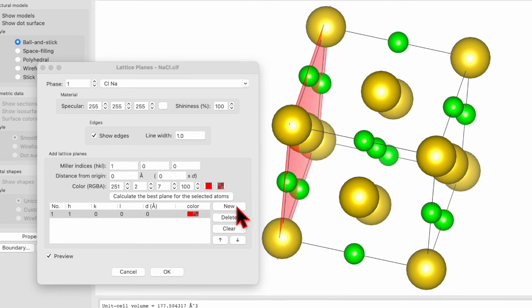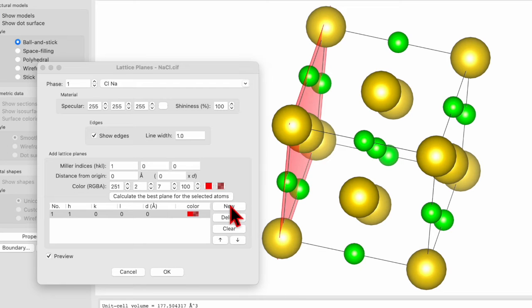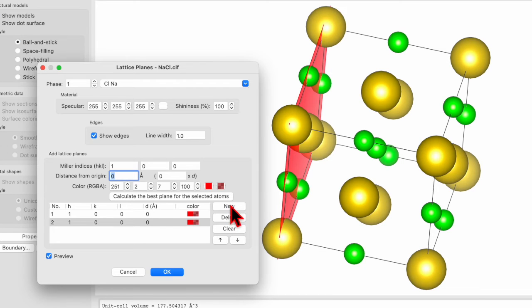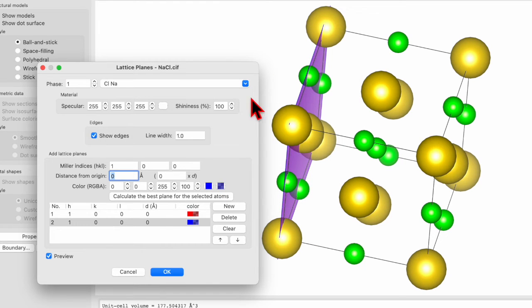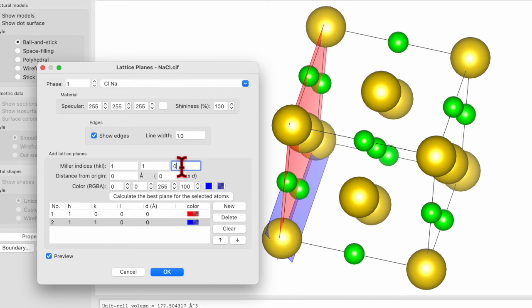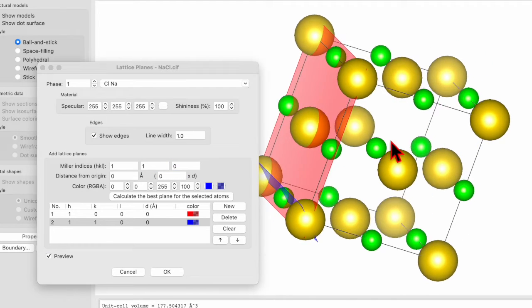Now you can show different planes in a similar unit cell. How to do that? Click on New. This time maybe I will use another color, a blue color. Keep the same transparency and let's select the second plane.